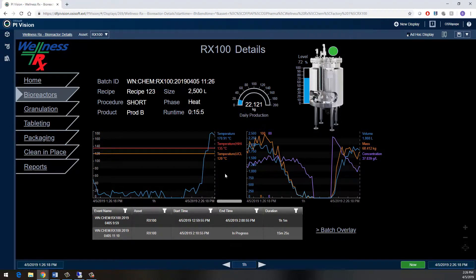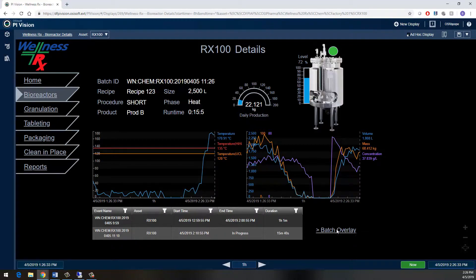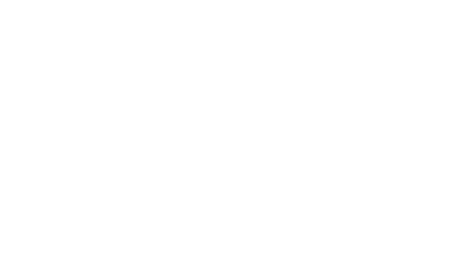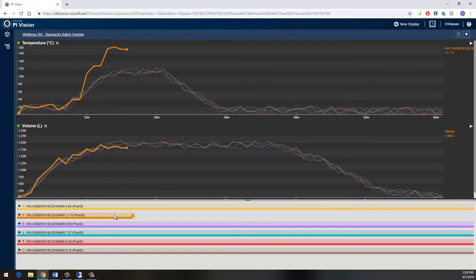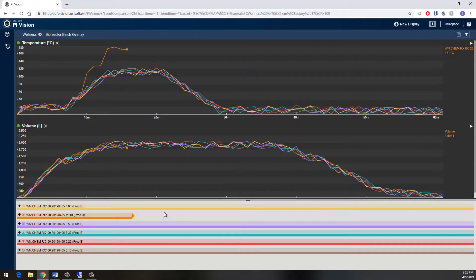I've clearly violated my temperature limit, but I want to see how this current run compares to previous product runs and what sort of impacts this high temperature may have on other critical process parameters. The easiest way to do this is to overlay my current batch run with previous batch runs, which I can do from this batch overlay page. Here I can see my currently running batch in orange, and my other previous batches including a golden batch are on the trends as well.